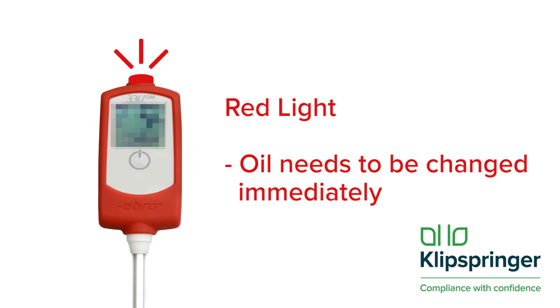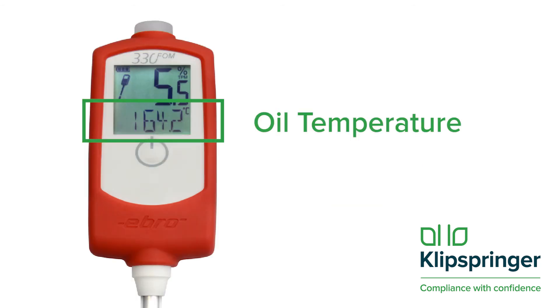If it's red, the oil should already have been changed, so change it immediately. The monitor will also show the oil temperature. It's important to ensure that your fryer is operating at the correct temperature.